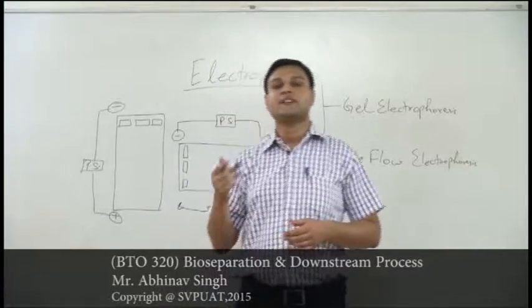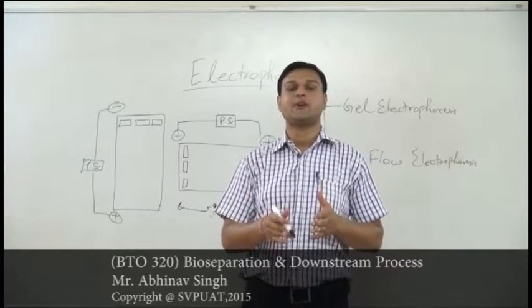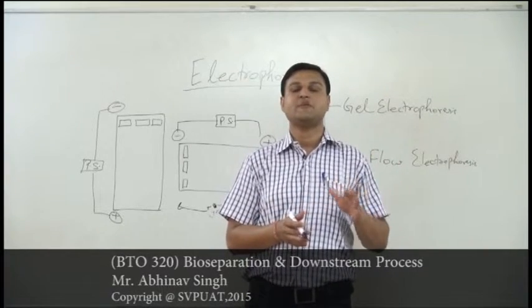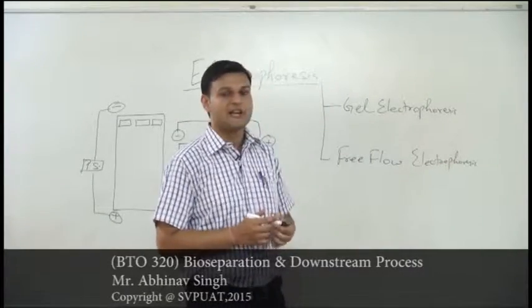We are not going to cast the gel, whereas we are directly going to apply the electric field into the liquid, and during the motion of the fluid, the particles will be separated on the basis of their charge. So first we are going to consider the case of gel electrophoresis.